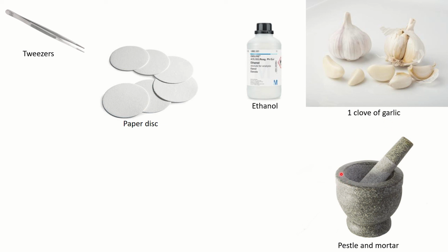So let the ethanol evaporate. So maybe leave it on the side for maybe a minute. 30 seconds might do fine as well. Don't wave it around in the air because you might catch bacteria on it. So make sure you just keep it still. Then you're going to place it into your petri dish. So you might place it over here somewhere.